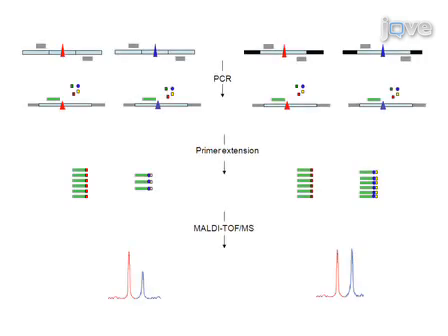Prior to performing this assay, design 2 pairs of PCR primers for each DNA marker, 1 pair for genomic DNA amplification and the other for cDNA amplification. Place forward and reverse primers for cDNA amplification in different exons to avoid genomic contamination. Design primers to obtain a PCR product in the range of 100 to 500 base pairs in length.